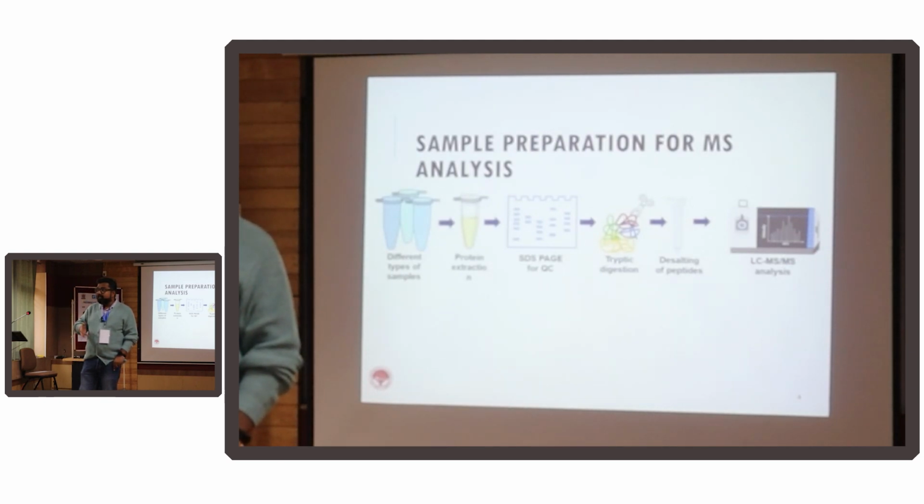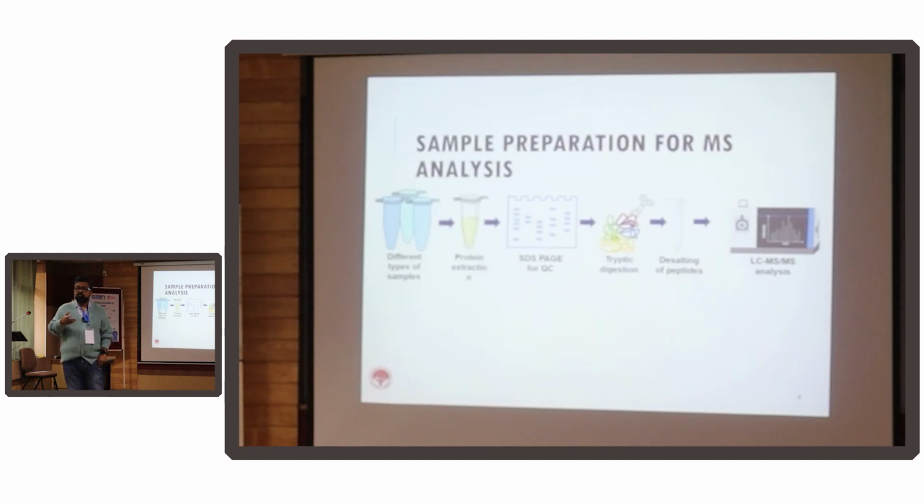But biologists started using it only after John Fenn told them that yes, you can ionize peptides. And he developed electrospray ionization. For electrospray ionization, if you have salts, they will start acting as inhibitors. It will stop the ionization. And you see, the better a peptide can fly, the better it will be identified.